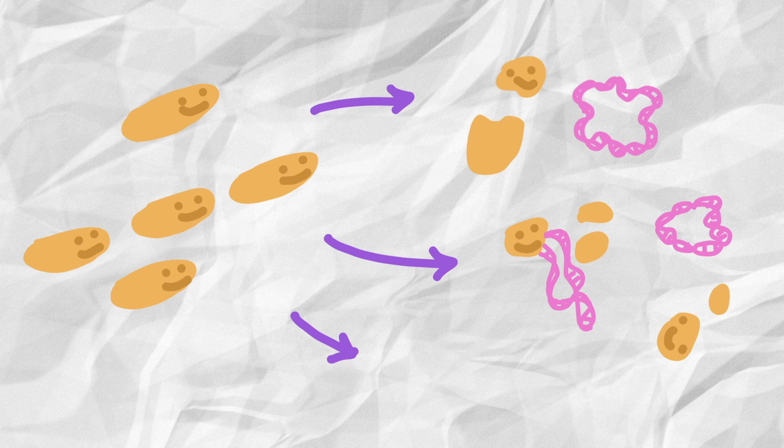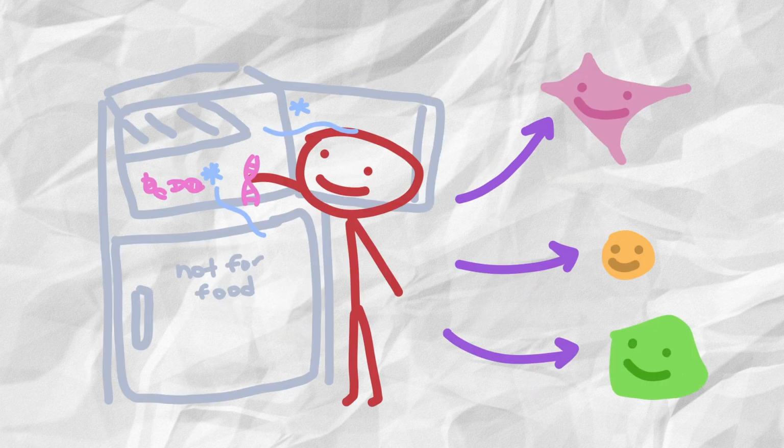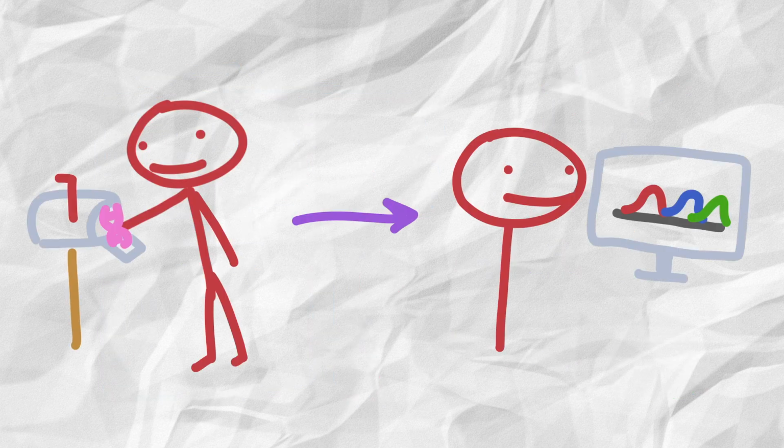E. coli is great at producing lots of DNA through replication. Once we have a culture of transformed cells, we often need to extract the plasmid so that we can actually use it. This could include storing it for future transfection, such as into mammalian, yeast, or plant cells, or to sequence our plasmid to confirm it's correct.